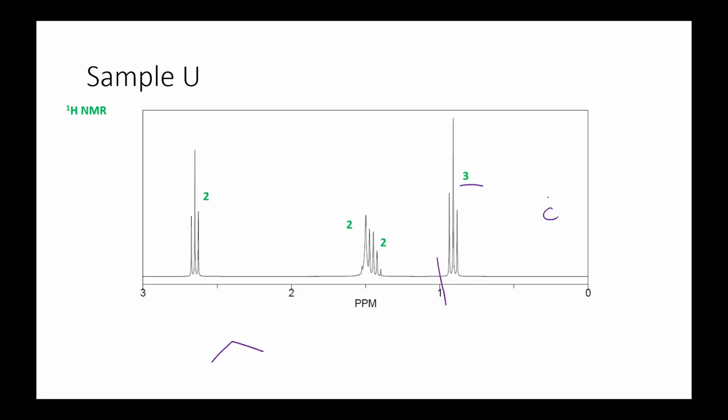And that is usually indicative of a CH3 group next to a CH2 group. And it's a really easy way to start building up your molecule to identify this signal, because it means immediately I can go in and put in my 3 hydrogens on one end of my molecule, and then the carbon right next to it I can put in 2 protons. And so I've already populated half of my structure.